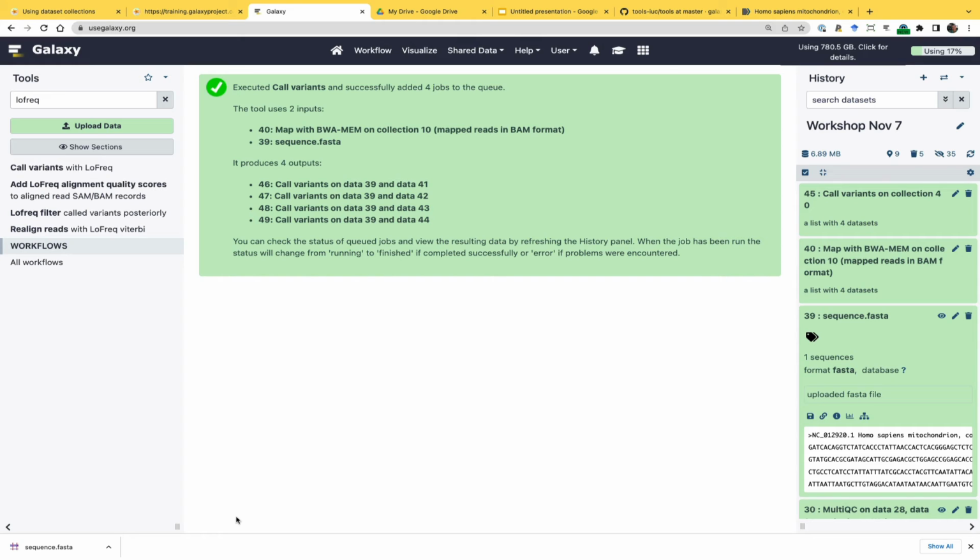It can get complicated to figure out 50-50 if you have low coverage, because when you have 4 reads and one of them is A and 3 of them are T, it can be a heterozygote, but it can also be a sequencing error. However, in this case, we are calling variants in mitochondria. Mitochondria is not diploid. Every cell has lots of mitochondria, and each mitochondrion has lots of copies of its circular genome. So it's like calling variants in E. coli or in COVID. We don't have a diploid expectation here, which means that we can have alternative allele frequencies anywhere between 0 and 1.